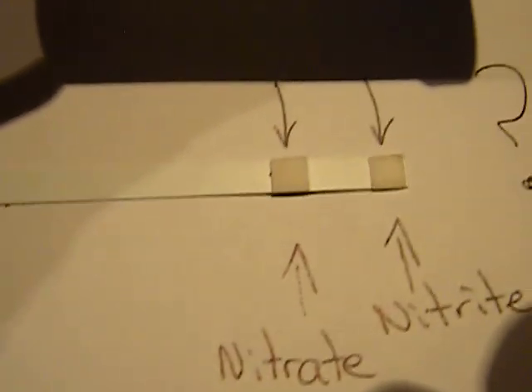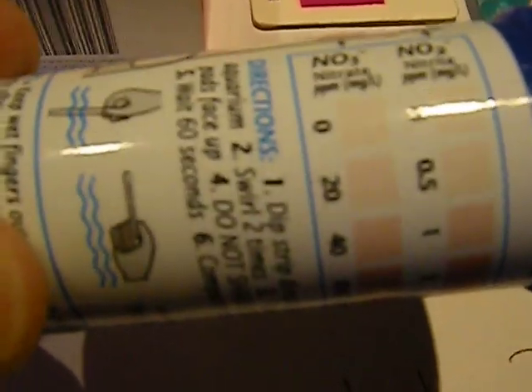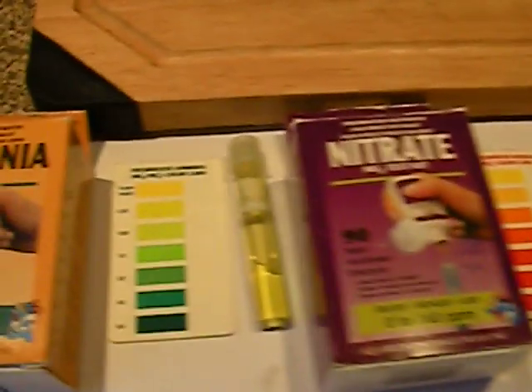You do the same — swirl it around in the water for five seconds, leave it for 60 seconds, and compare. On the nitrate there is a very small tinge of pink which would indicate something like 20 to 40 in between there, which is again my question mark — I really don't know what it is.